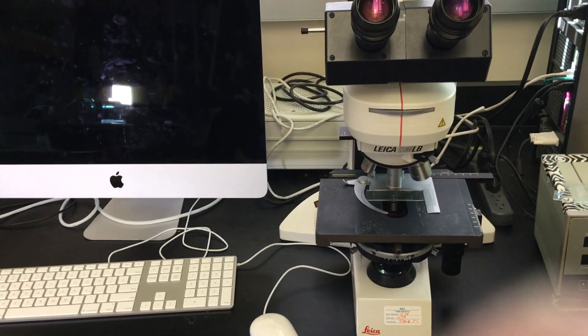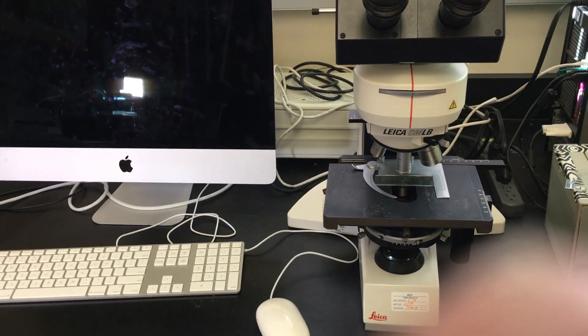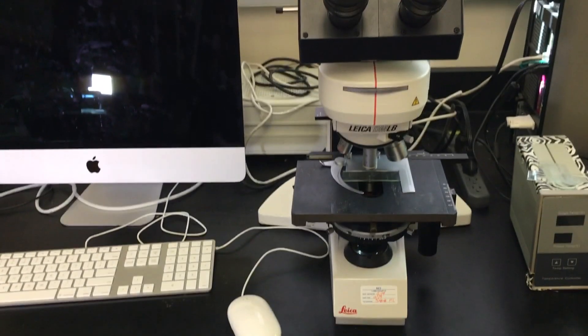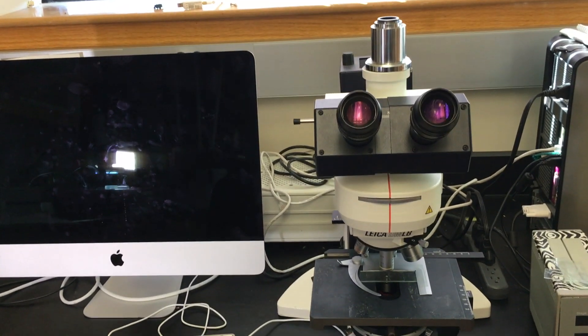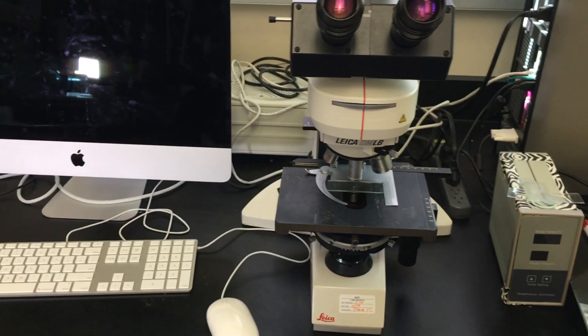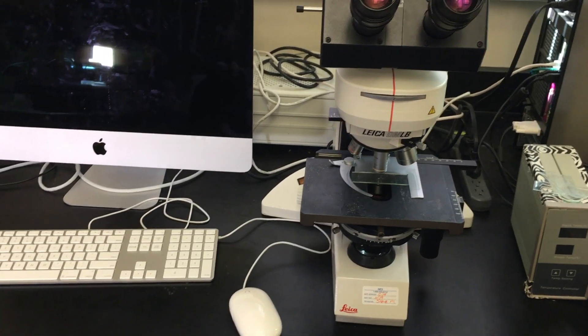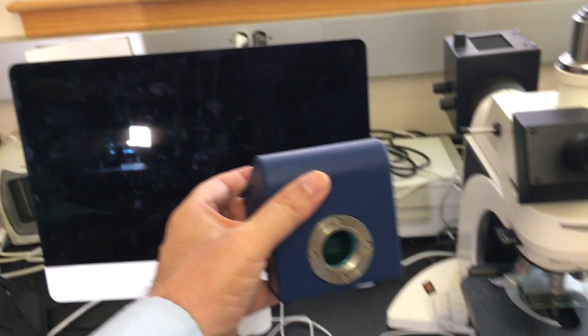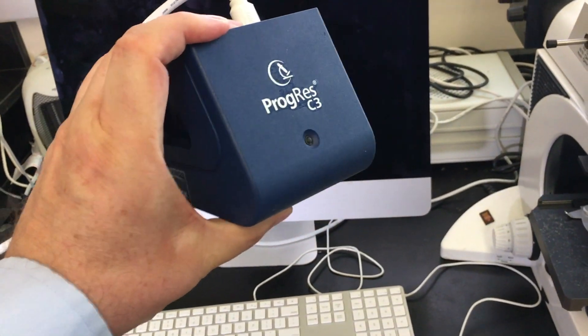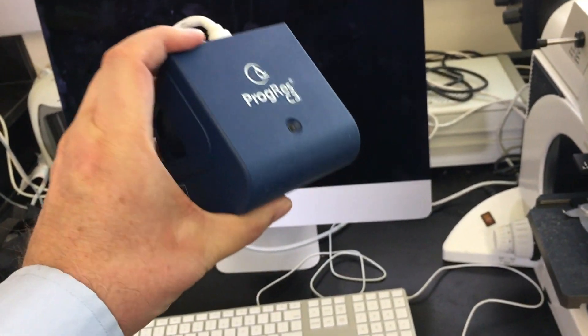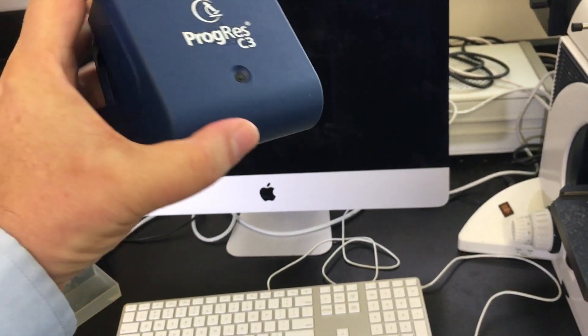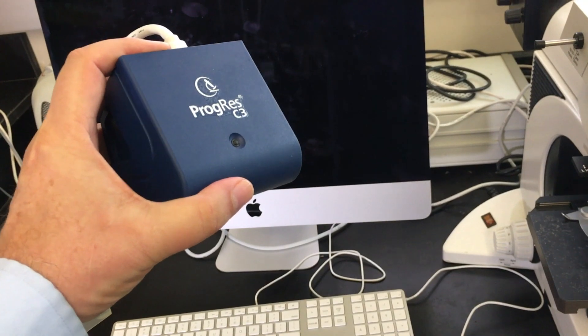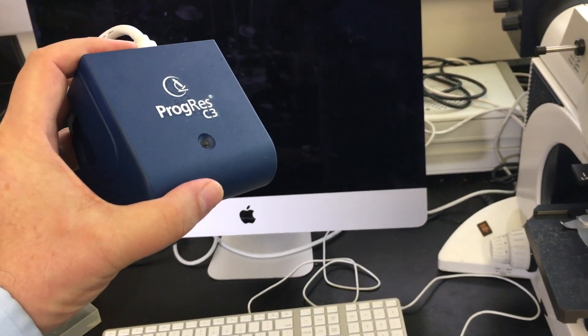This is the big scope, this is my Leica DMLB. It's also pretty nice. This has a scientific imaging setup on it - the Progres C3. It's a nice little camera, kind of limited what you can do with it, but it interfaces nicely with the computer over there.